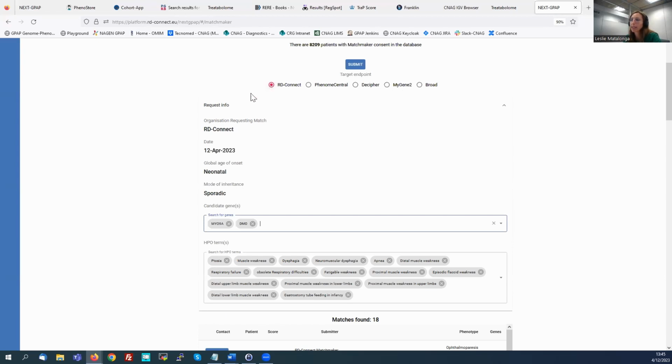But the thing is that we need to have this gene tagged in the system, so that another group should have also identified this candidate gene, so that you have a match. If you want to go randomly across all the database, then you will need to create your cohort based on the phenotypic data, and then look at the variants and identify yourself this second patient.